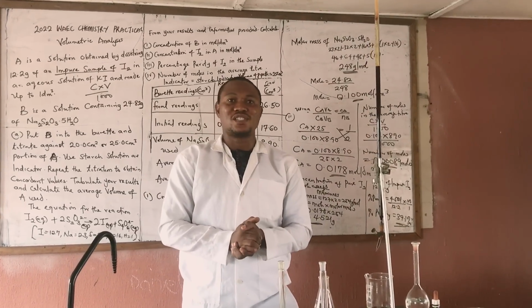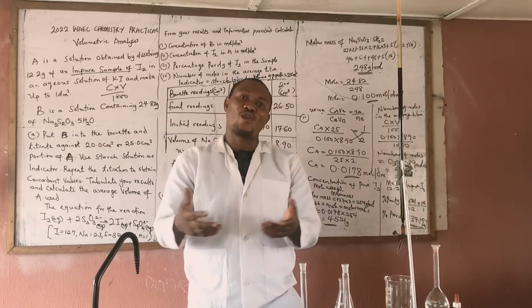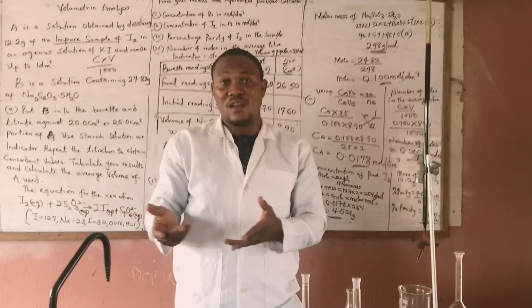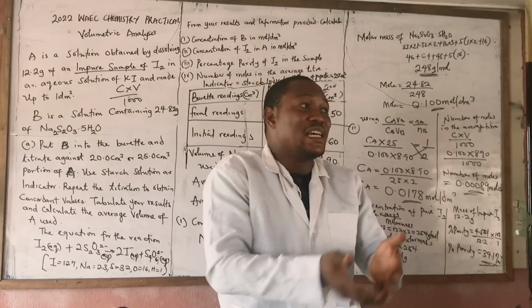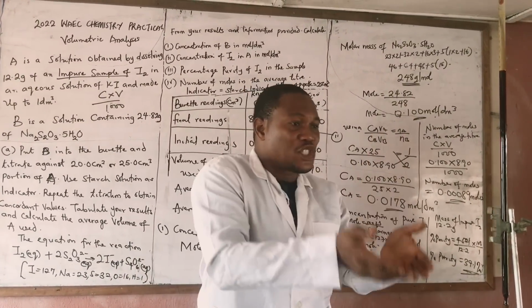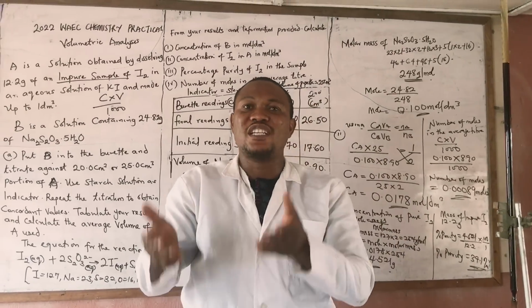My fellow chemistry teachers, please, let's just prepare the solutions and I'll wait what the question is going to be. But you don't need to panic. Let's just go by the specifications they give us. They actually know what they are doing, okay? So let's see what is going to happen with the question on that day. Let's have the reagent prepared. That's what I've told other fellow chemistry teachers that have called me. Make sure the iodine solution is prepared. Make sure the sodium thiosulfate is prepared.